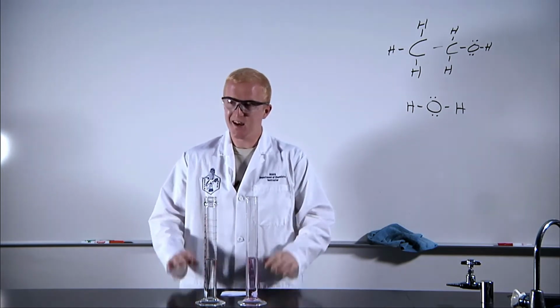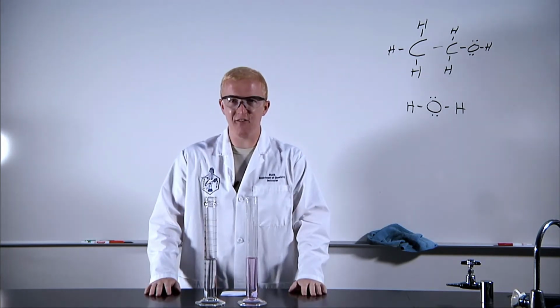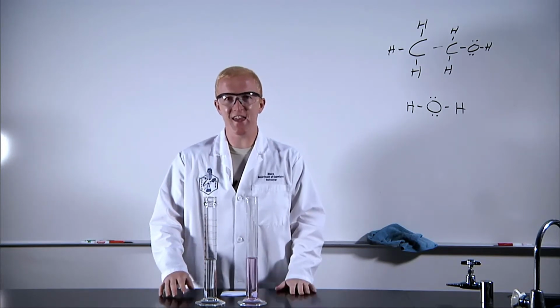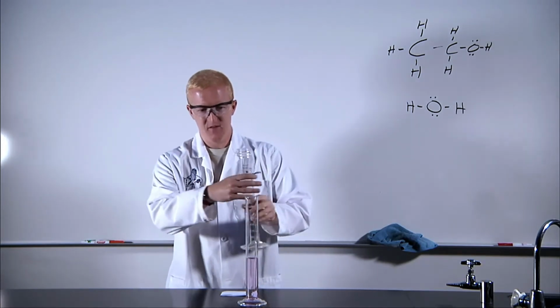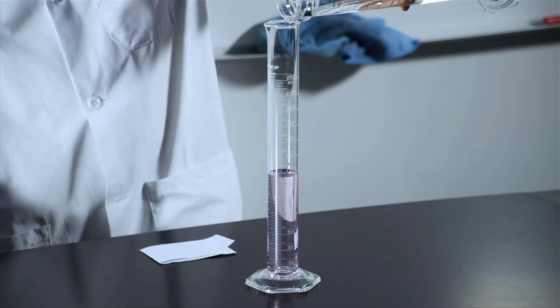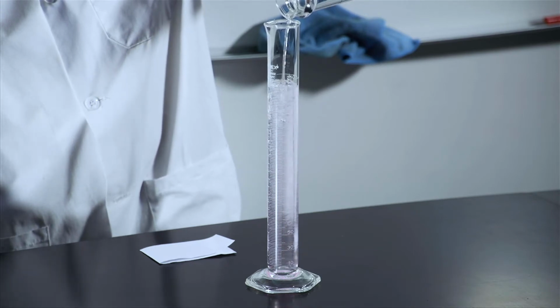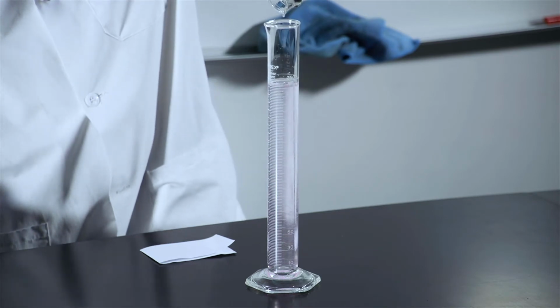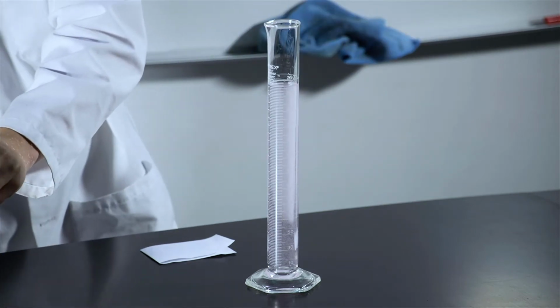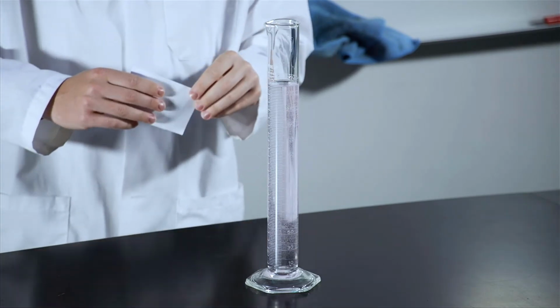So I'm going to do that. Again, remember, mixing these two things, you would think that we're going to have a final volume of 250 milliliters. Now, let's see if that happens. Almost all of that out of there. So kind of mixing a little bit. You can see that sort of pink contrast from the ethanol.